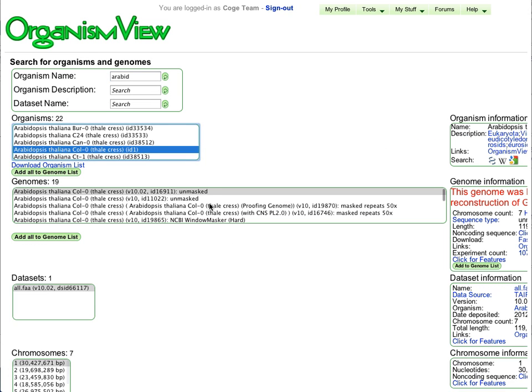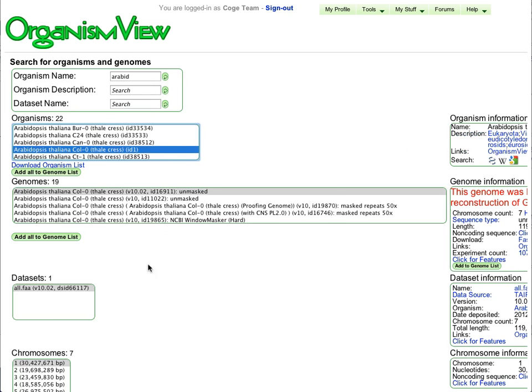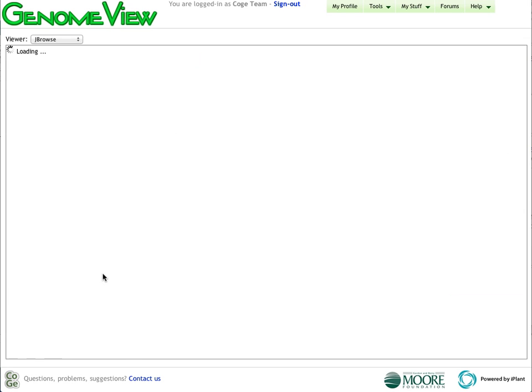In terms of Columbia Zero, we have over 1,000 functional genomic experiments associated with this genome, including many expression datasets, RNA-seq, methylation datasets, and diversity datasets.